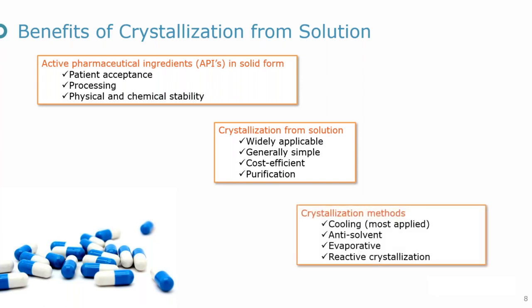And then we have a few methods at our disposal for solution crystallization. Cooling crystallization, which is the most applied one in industry, and I will talk about this in more detail. But in case you have a compound that is thermally labile or does not have a good concentration relationship with the temperature, you can also opt for anti-solvent, evaporative crystallization or reactive crystallization.